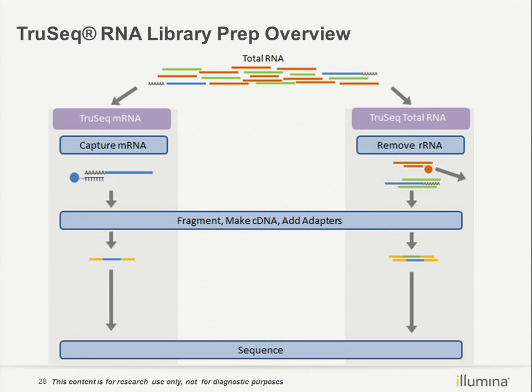Okay, so I would like to say there's no perfect method, of course. So maybe we can first see the disadvantage of the first one. The first one actually is very simple, but it has some limitations. If your RNA is very fragmented, for example, you get your sample from FFPE samples, the RNA is very fragmented, and only a small amount of the messenger RNA has the poly-A tail.